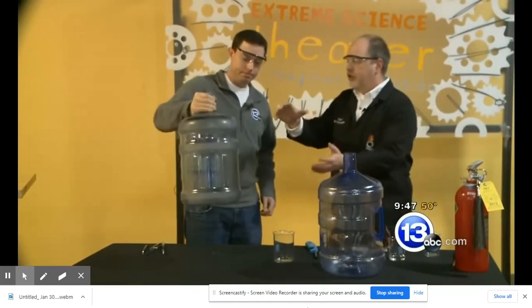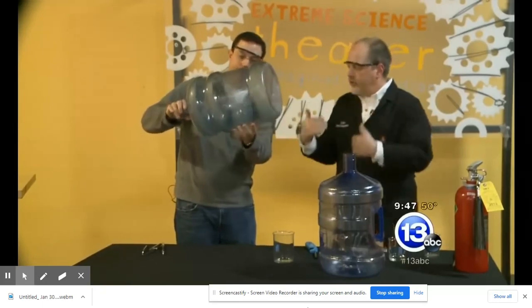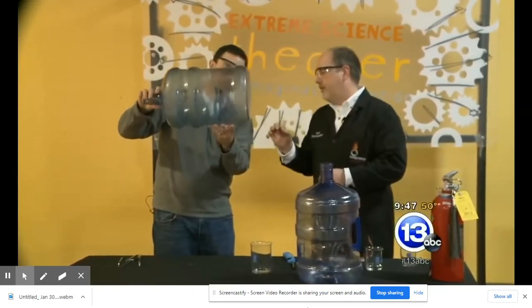And if you can, carefully tip it almost on its side and rotate it. But don't let any of the liquid come out. That's perfect. We want to coat the inside. We're going to build up lots of vapor because that's what we want to ignite. We're going to show you how flammable some vapors can actually be.